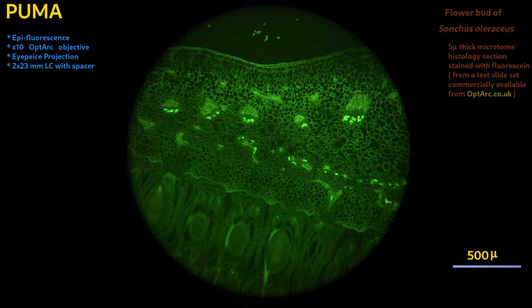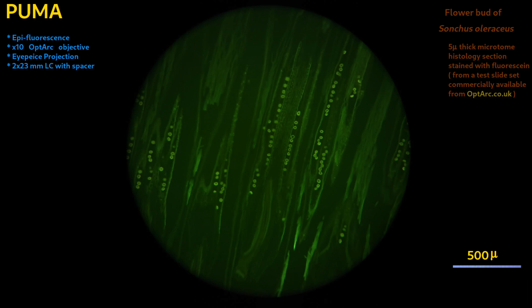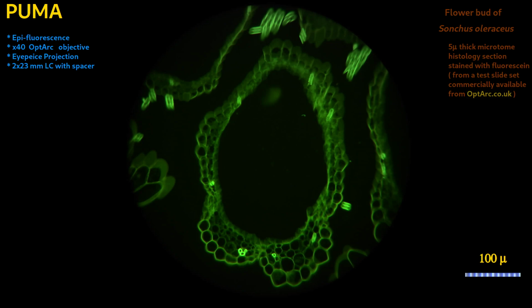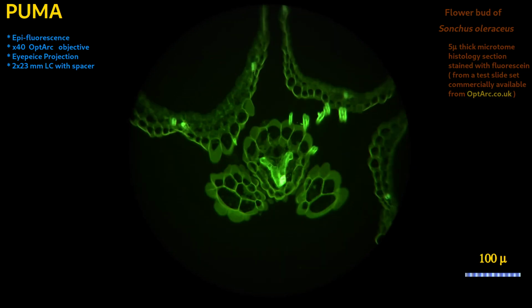This first set of images you are seeing are the whole field of view images using afocal eyepiece projection. These show various structures of a histological section of a flower bud. To keep the video short, I won't dwell very long on each image. You can use the YouTube pause facility to examine the images for longer if you wish.